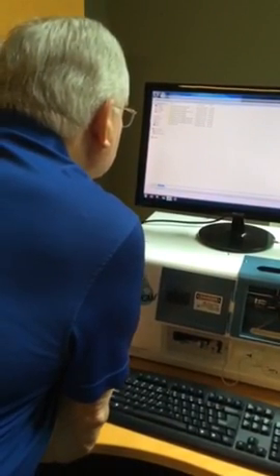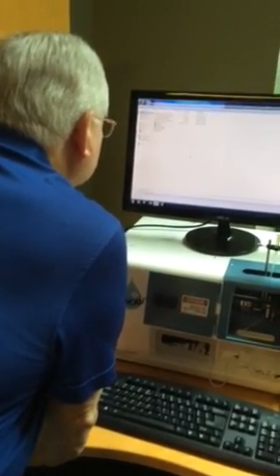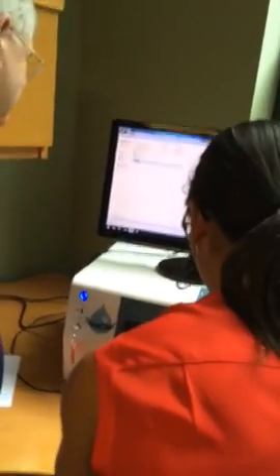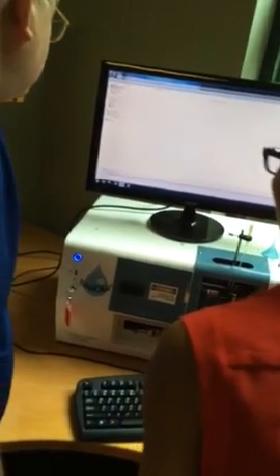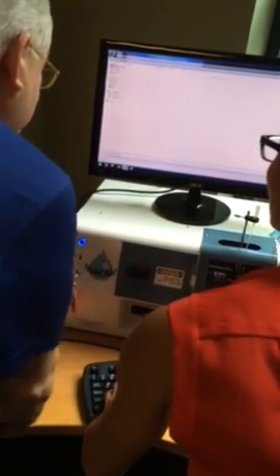And in this case, it's going to ask you where you want to save it. Now, this is where we will put your data management skills to the test. So you're going to have the curse of so much data and where to put it and how to organize it. In this case, we're going to do a folder designated for 4x 300 micron samples.